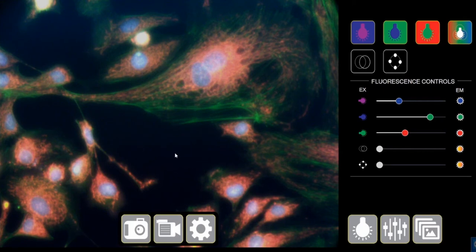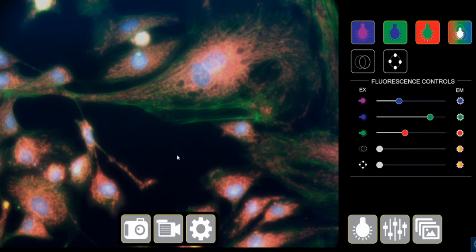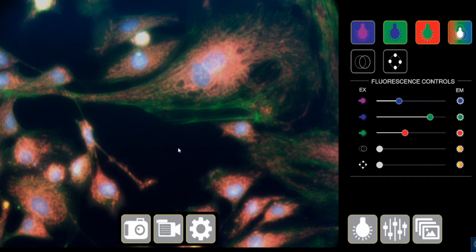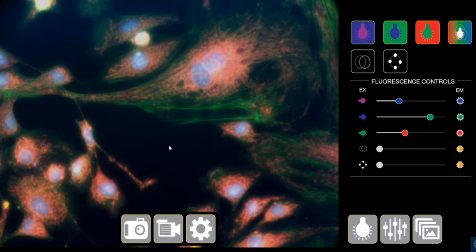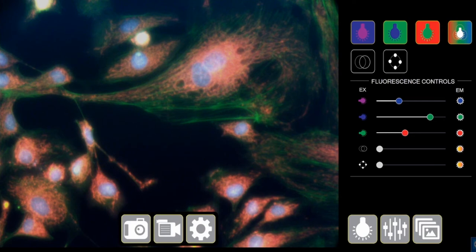So this speaks volumes about how easy and user friendly this software is. You can use it to easily scan your entire slide and look at areas of interest. This is made possible by the patent pending SIBA lit light cube that we just saw and also our patent pending SIBA lit software.